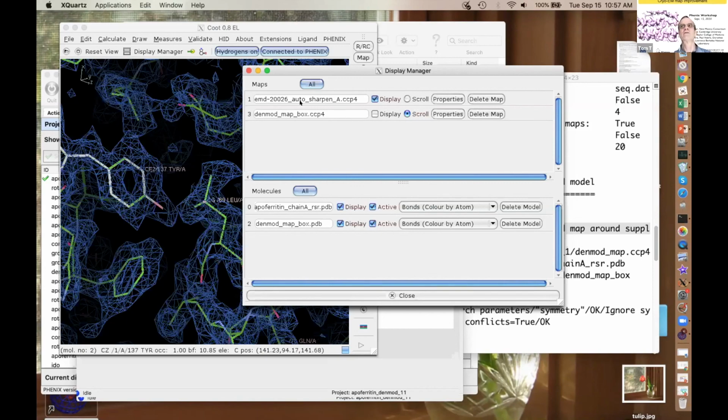What if there's a detergent belt that's kind of in between? That violates the assumption that they're separate and different. So then you have to treat that one either as if it's like protein or like solvent. So that one necessarily is going to work less well than it would otherwise. Those are the big reasons.